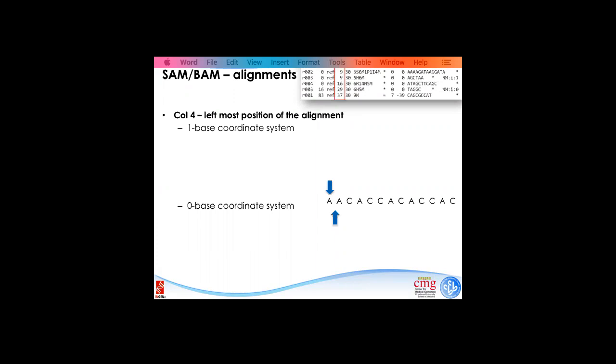Okay. All right. So we talked about the BAM file, and just barely went through it a little bit, but you can see my point. My point is not telling you which bit means what. There's a lot of information packed into this file format. There is a tutorial you can read, and if you really need to do anything, you probably need to write a little bit of code to get the information out.